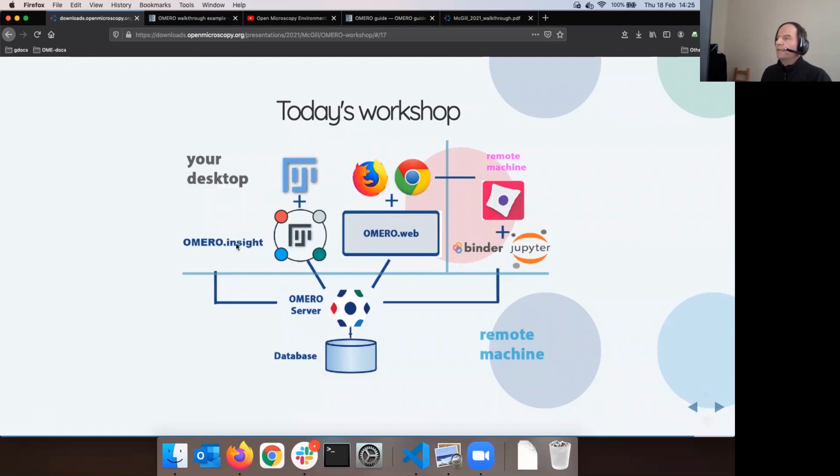We will then go away from Omero Insight and go to Omero Web. This is the reason that Omero Web, which we would like to ship as our main client, does not have the importing ability. Maybe it does not have it yet, but maybe there is also a question whether this is the wisest thing, to drag a lot of data through the web interface at all.